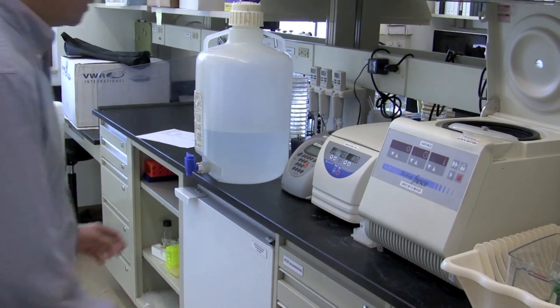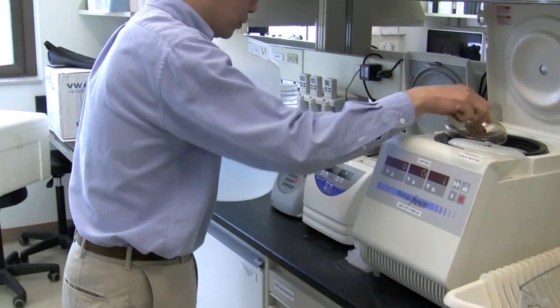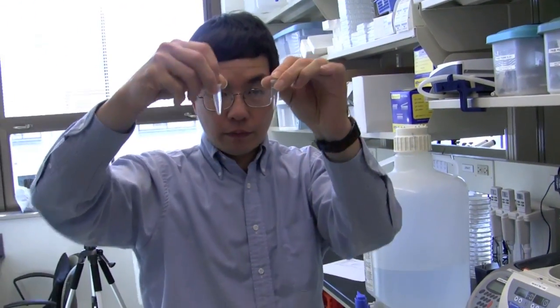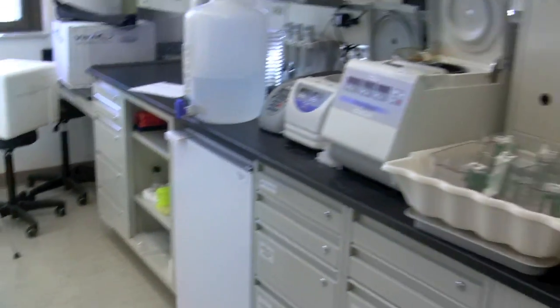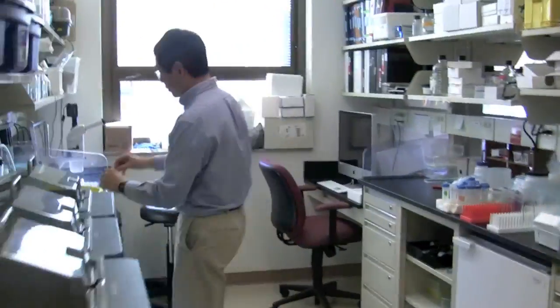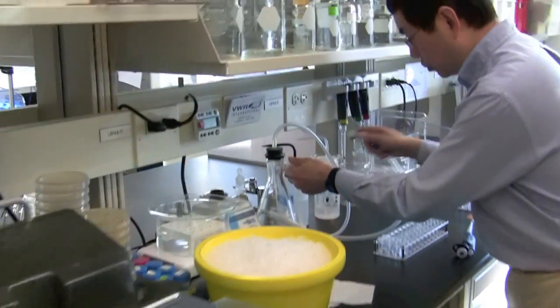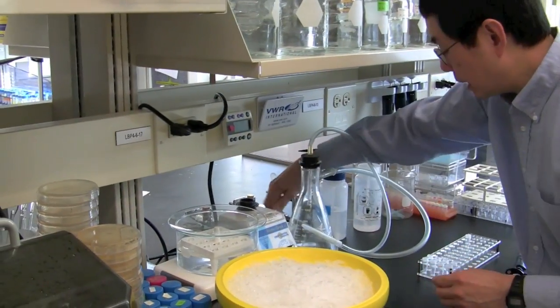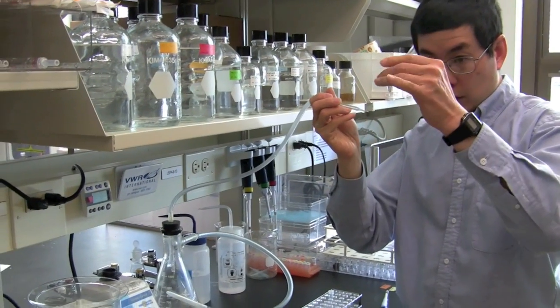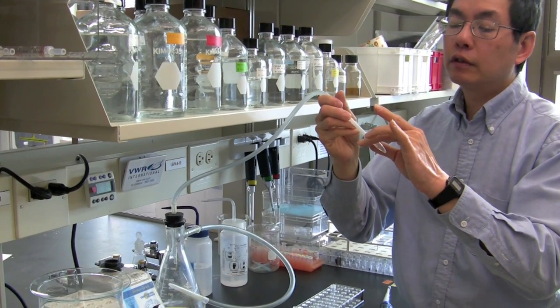Okay. All right. So set 1 minute up. We'll see that the pellet is at the bottom, and what I'm going to do is aspirate off the supernatant, and then I'm going to spin it very briefly just to bring down any little bits of any remainder of supernatant. So I've got my aspirator. I'm going to suck off.